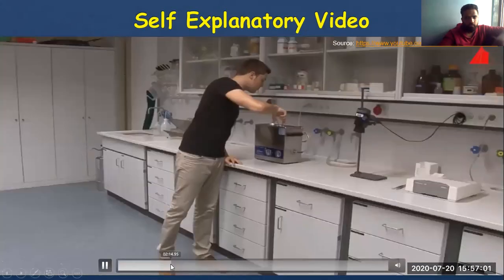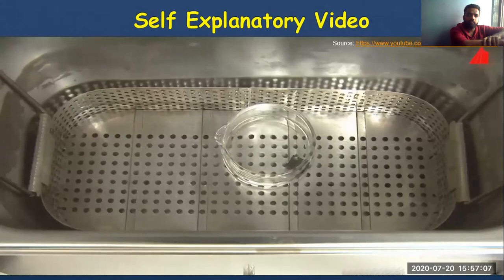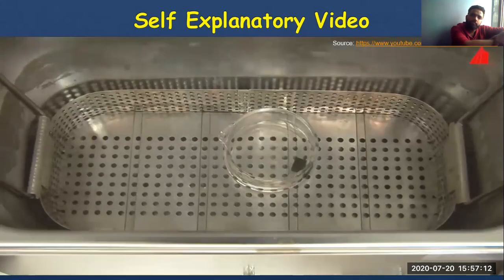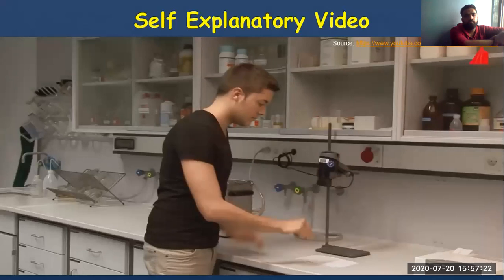The specimen is placed in an ultrasonic cleaner bath for a few seconds. Alcohol and ultrasonic waves help to remove fat and loose particles from the surface. A short time under the hairdryer and the specimen is clean and dry. To mount the specimen, small plastic molds are suitable.